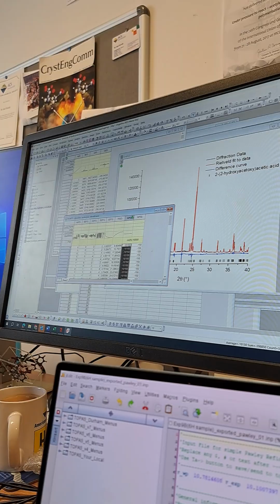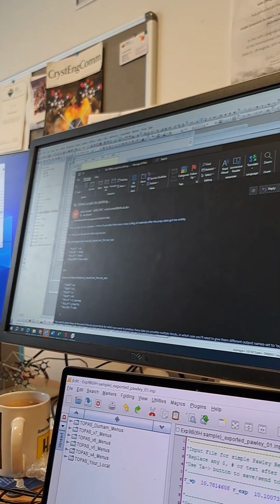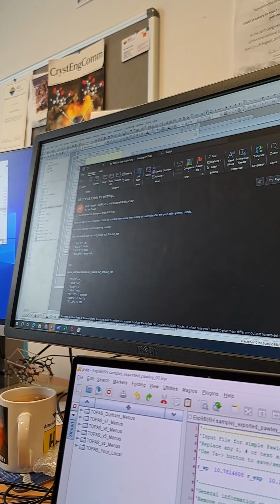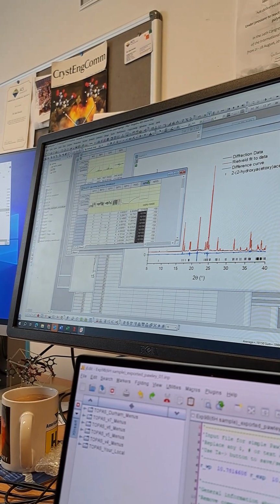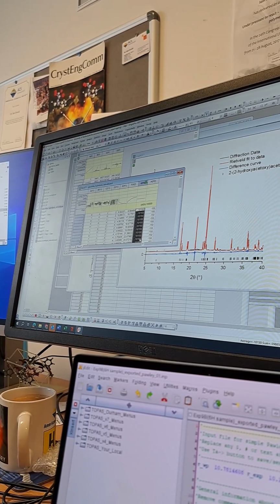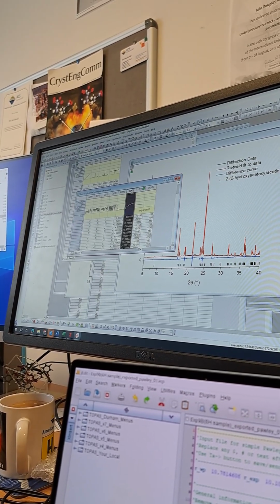For this one here, you need to work it a little bit. So this is the other graph. This is the second component, this phase out. You can see that's HKL, it's called HKL ASCII. As long as these ASCII files are named differently, that's fine. But essentially what we have here is HKLM, then our d-spacing, 2 theta value, and then some sort of y coordinate.